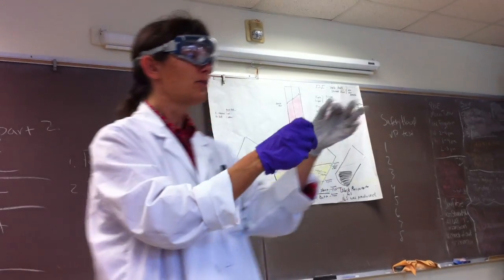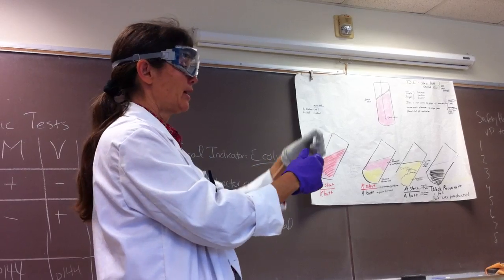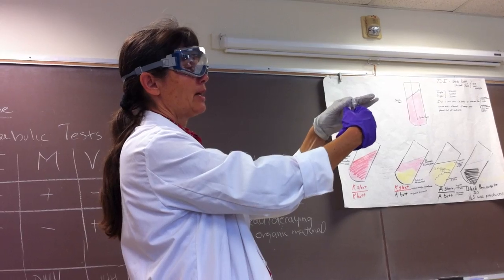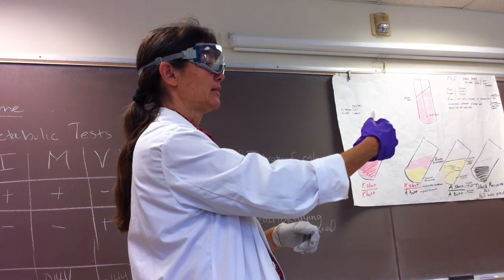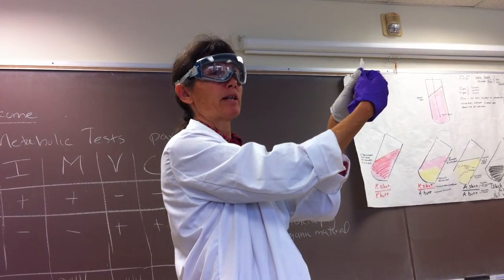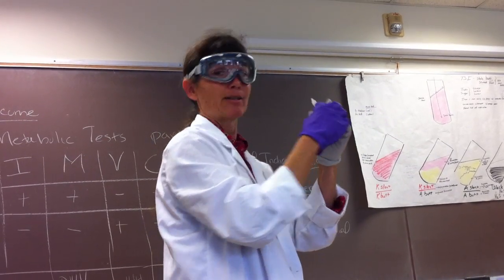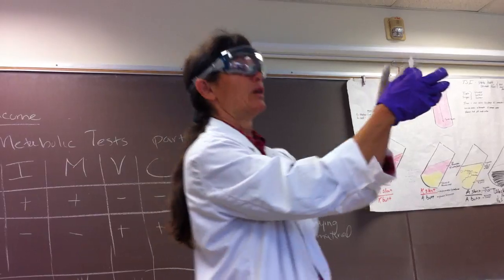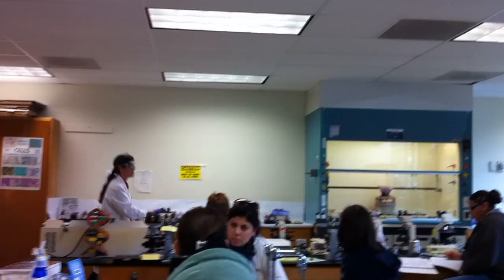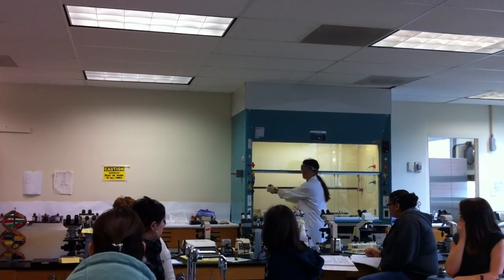I have really weak fingers, you guys, so I have to do this two-handed. I'm going to hold the alpha naphthol, the VPA reagent, between my thumb and index finger, and because I'm so weak, I do a sandwich with my other hand. I'm going to point the tip away from myself. I don't want to go like this or like that, right? What we want to do is point it towards the corner of the safety hood, away from ourselves, and do a single squeeze, and you'll hear the glass tube crunch.